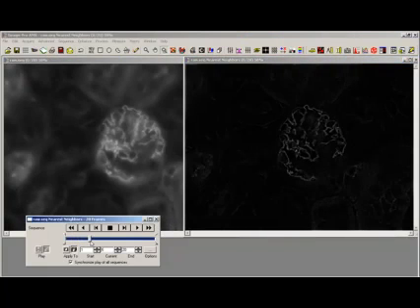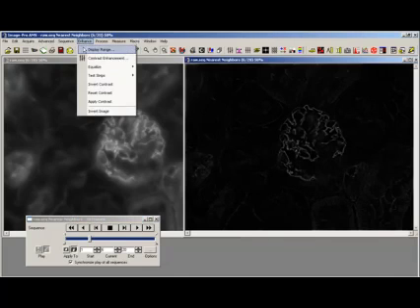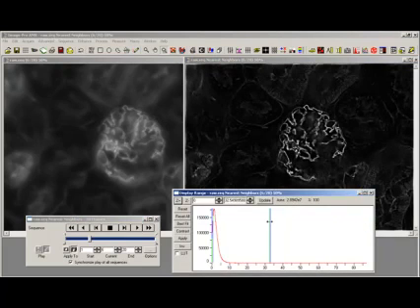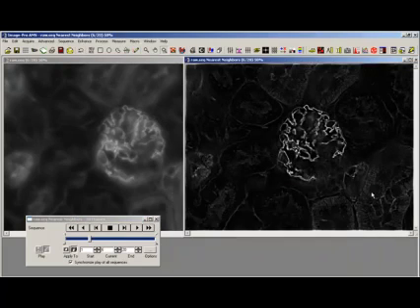So if I just roll these through to the middle, you can see the nearest neighbor image is actually a lot darker. So what I'm going to do is just change the display range of this image. And we can just look at that next to each other now. Now we're a lot closer to the noise because we've done the deblurring. We've ripped out the haze, sorry.